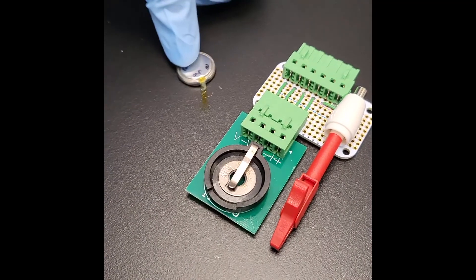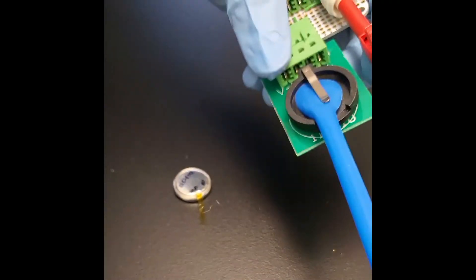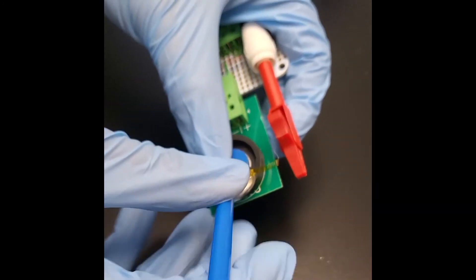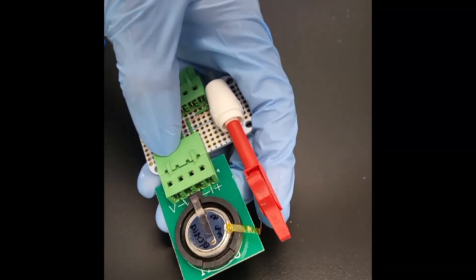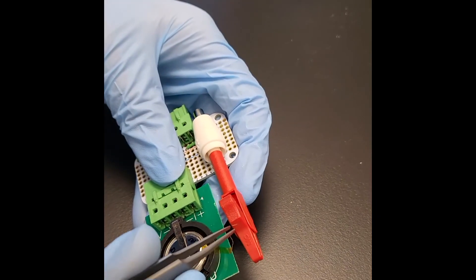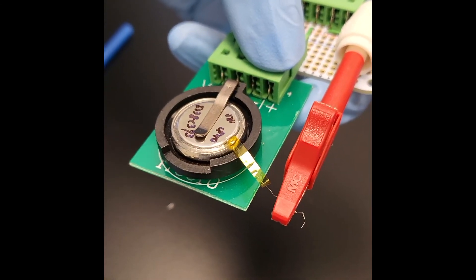Now it's time to load our cell into a holder. We made these adapters where you can plug in a normal four-terminal coin cell holder and make it into a six-terminal holder with an alligator clip for the extra electrode. Feel free to design your own holder that works best for you. Notice that we are loading the cell upside down so that the tap is more easily accessible. This means that you want to put the plastic spacer on the clip side when loading the cell. Now clip the reference electrode and you're ready to load the cell into your cycler. Remember that first, you will want to plate lithium on the copper mesh before you can use it as a proper reference electrode.